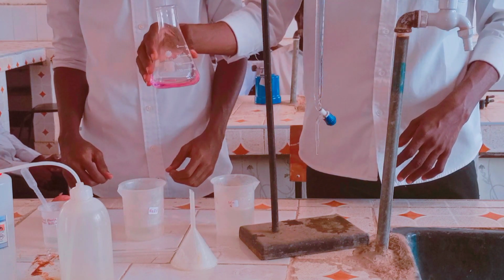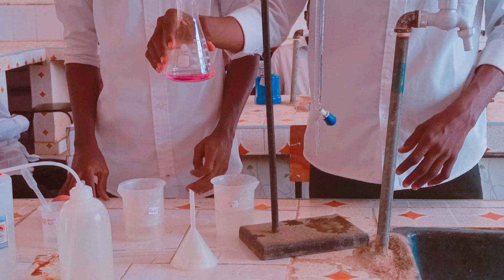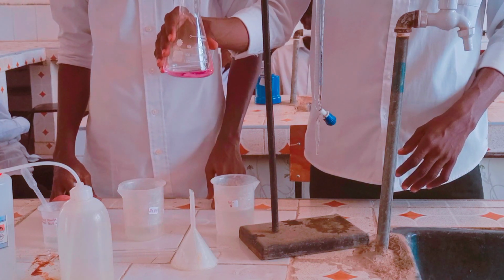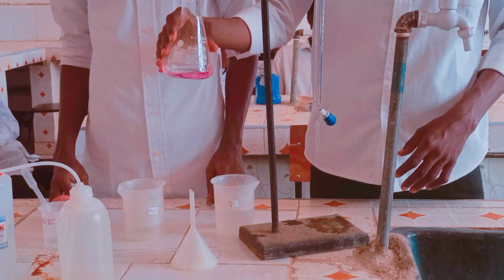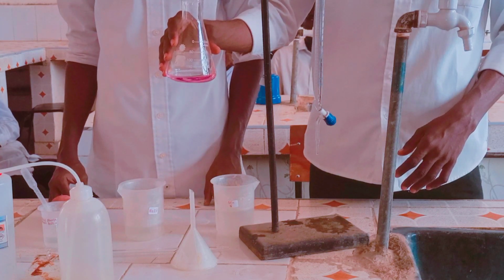So that's a color change. Remember, what we pipetted was sodium hydroxide, solution L, and we have added phenolphthalein indicator. So the color change, learners, is pink. Phenolphthalein indicator always turns pink in basic solution, that's sodium hydroxide. So this solution we are now going to titrate with solution N from the burette.